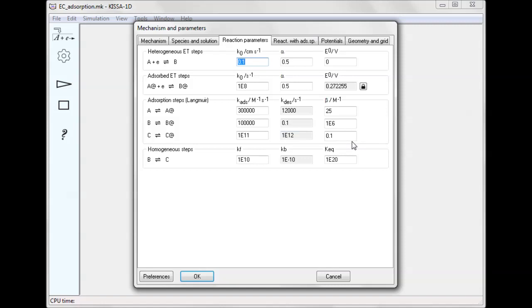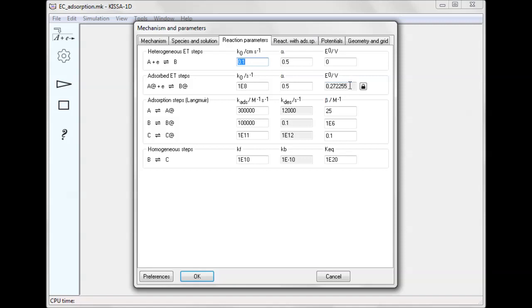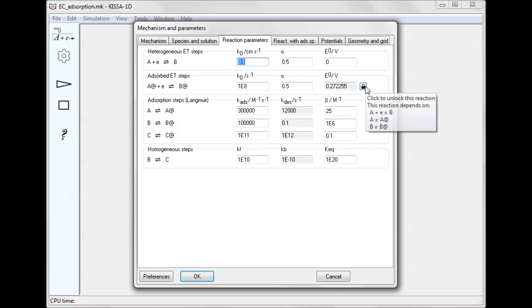At equilibrium, adsorption-desorption follows the Langmuir isotherm. Note that the value of E0 for the electron transfer in the adsorbed state cannot be changed, and there is a lock next to it.